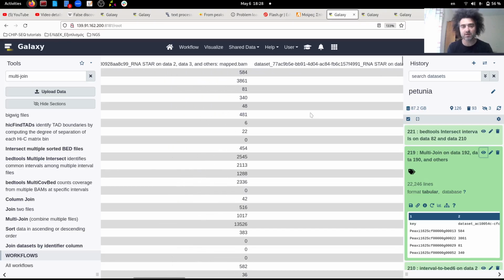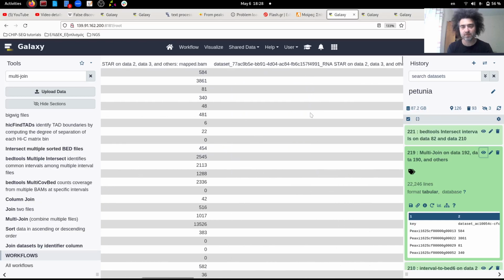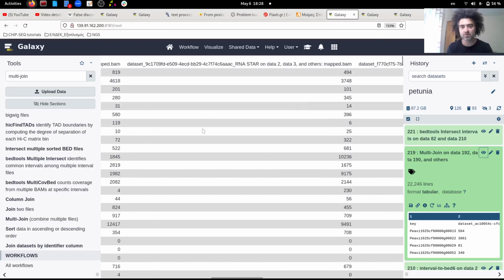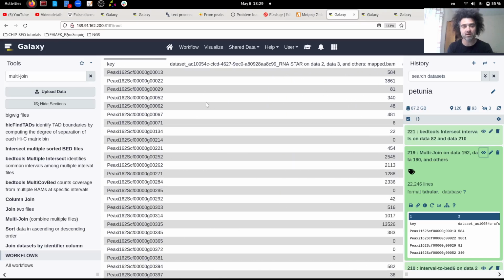So for example, this is important because if you want the first 3 columns to be from a certain condition, this will be easier for edgeR later on, then you should select the files in the appropriate order. Okay, so this is how we merge files for edgeR after the featureCounts analysis.